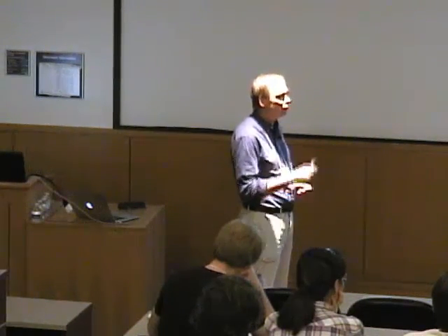So it's often actually difficult, I think, if you're studying a system where you have a somewhat asymmetric environment to start with, which is the one you're interested in, to decide if all of the spectrum you're looking at is really coming from the iron that you're interested in, and how much of this is something that's somewhere else in a different environment, right? And that can be a real problem. If you've got a very symmetric environment, like in a heme protein, then you're in good shape because you can easily recognize the junk iron from the heme iron. But in other circumstances, it can be tricky to distinguish those.